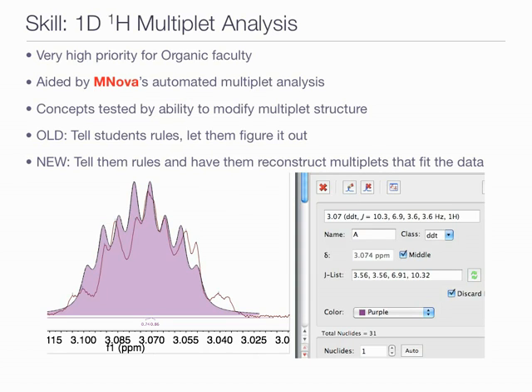One of the other nice things about this software is that you can use this for multiplet analysis. And this is what we've been seeing all morning. This figure was made with an earlier version of the software. Maybe the latest version would be able to totally get this. Maybe, but if you take a look at that multiplet, you can create the predicted appearance of the multiplet, and you can automatically see, okay, these two things don't really go together, right? There's something wrong. There's something that we don't understand.